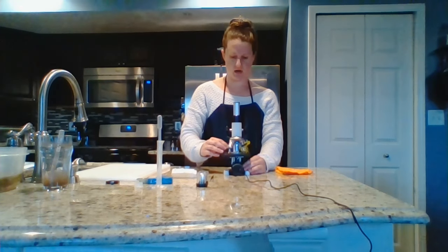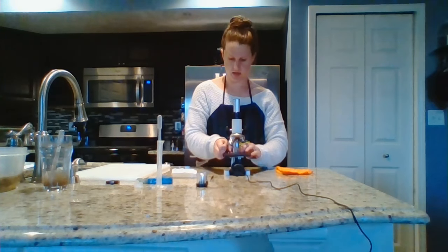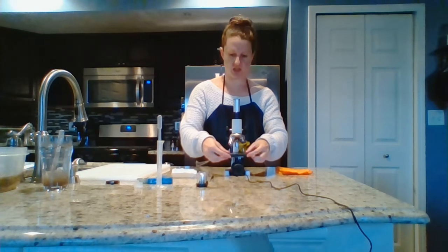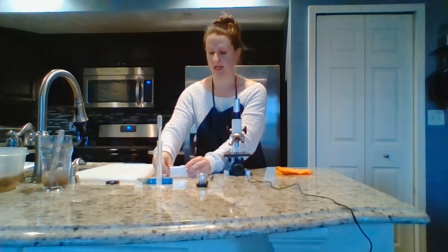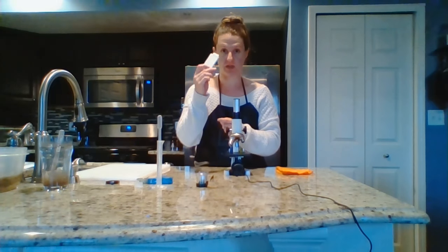Once you've finished with your prepared root slide, bring your microscope all the way up, undo the stage clips, and put the microscope slide back. We're going to use this in a different lab later on this year, so try not to lose it or break it.